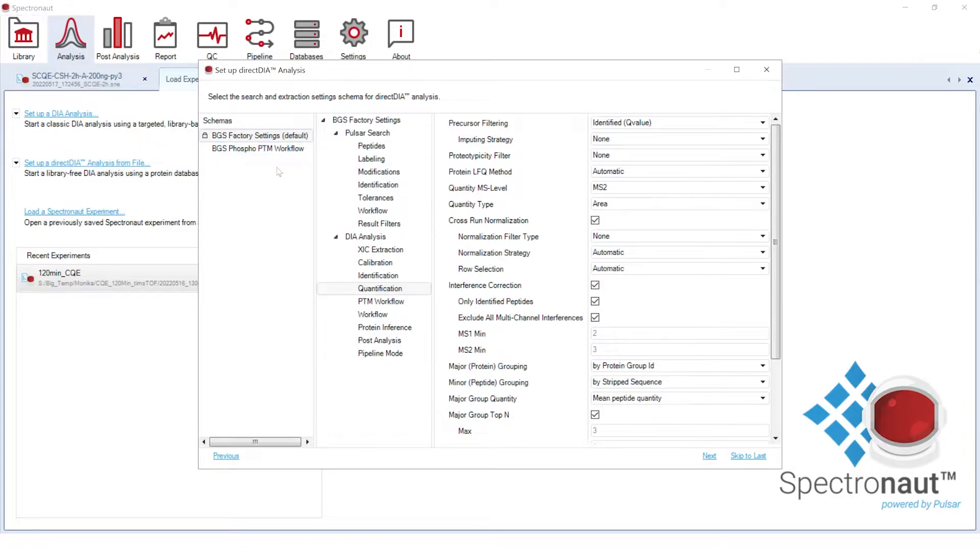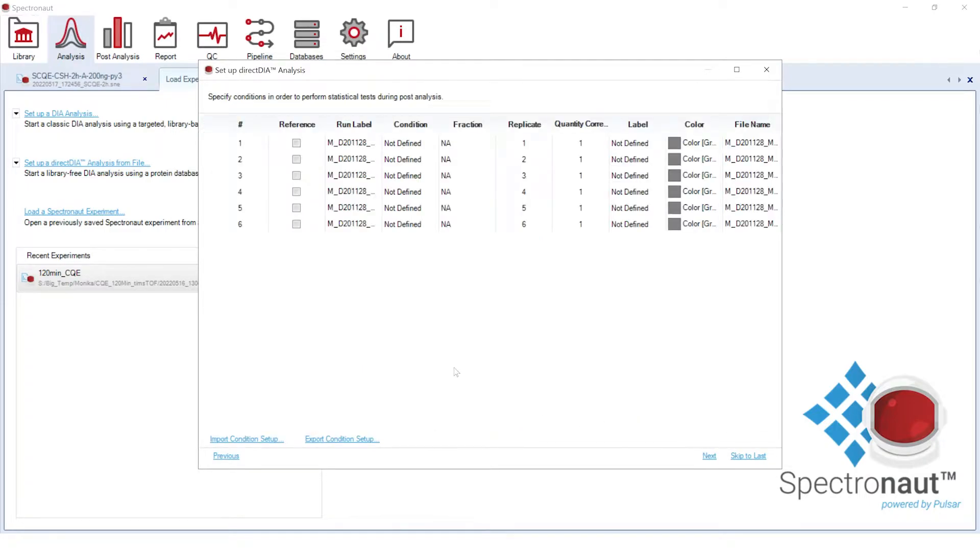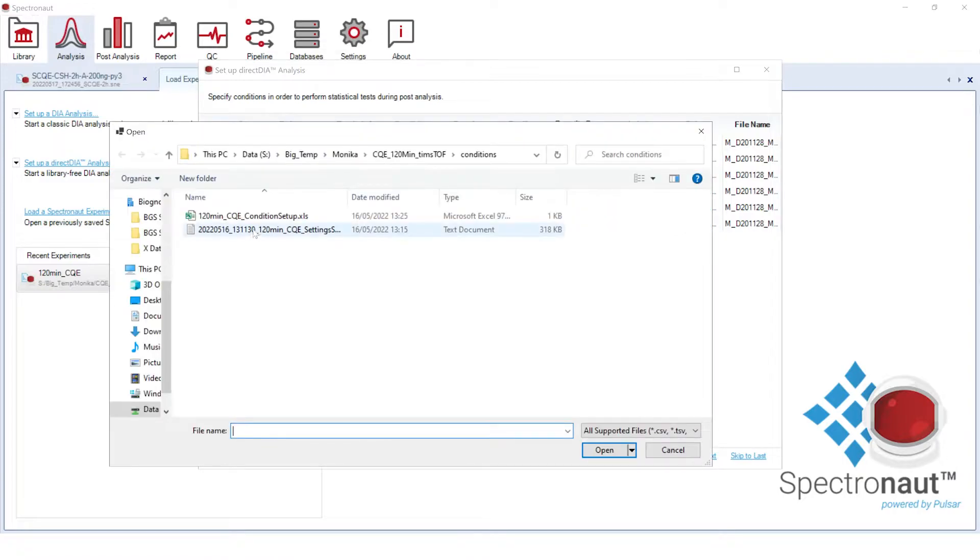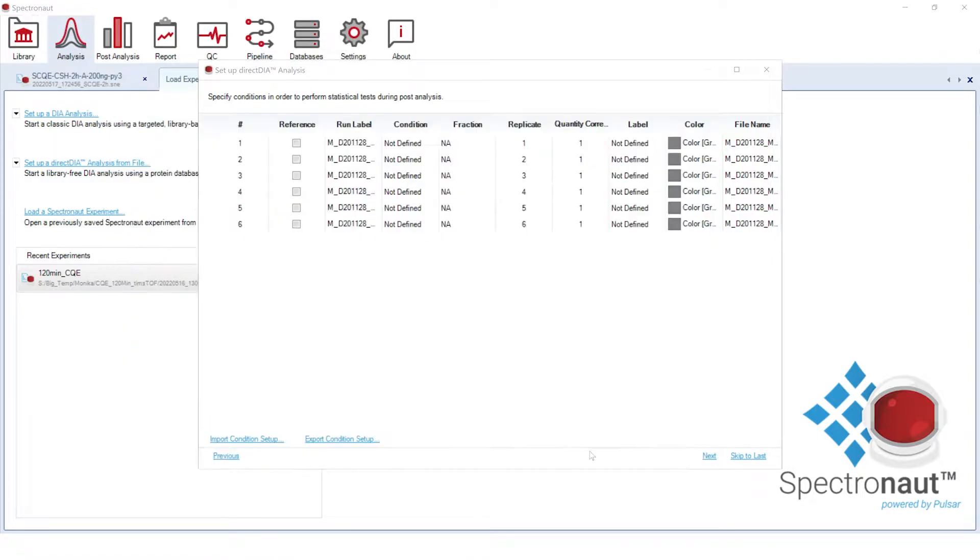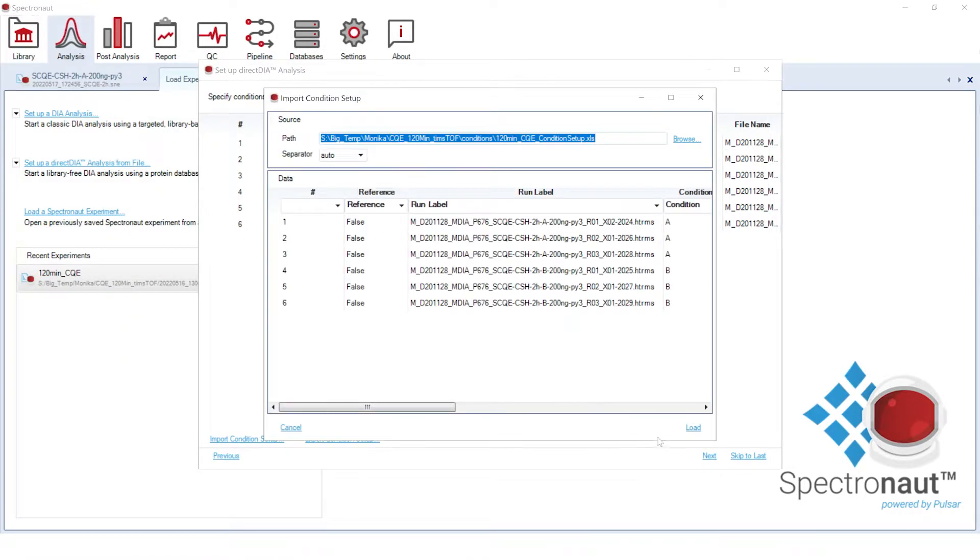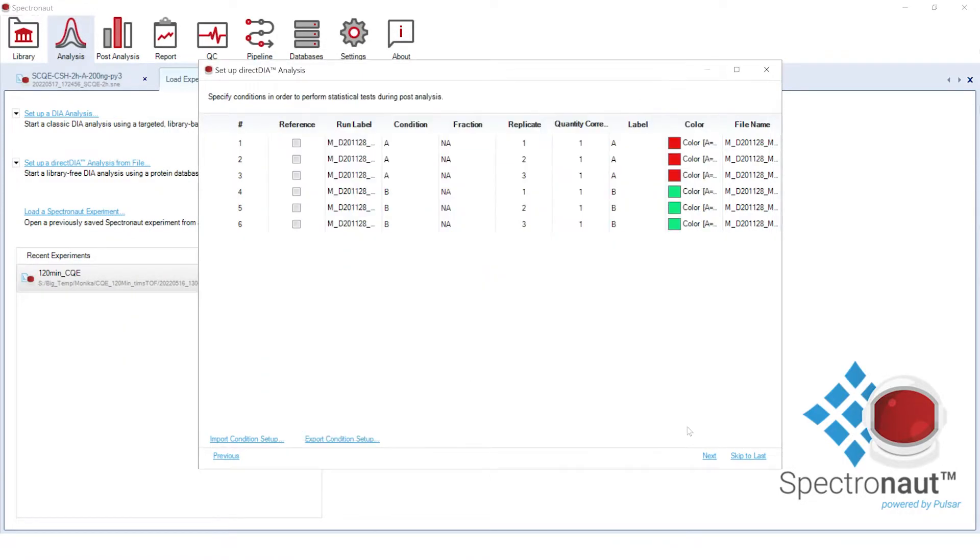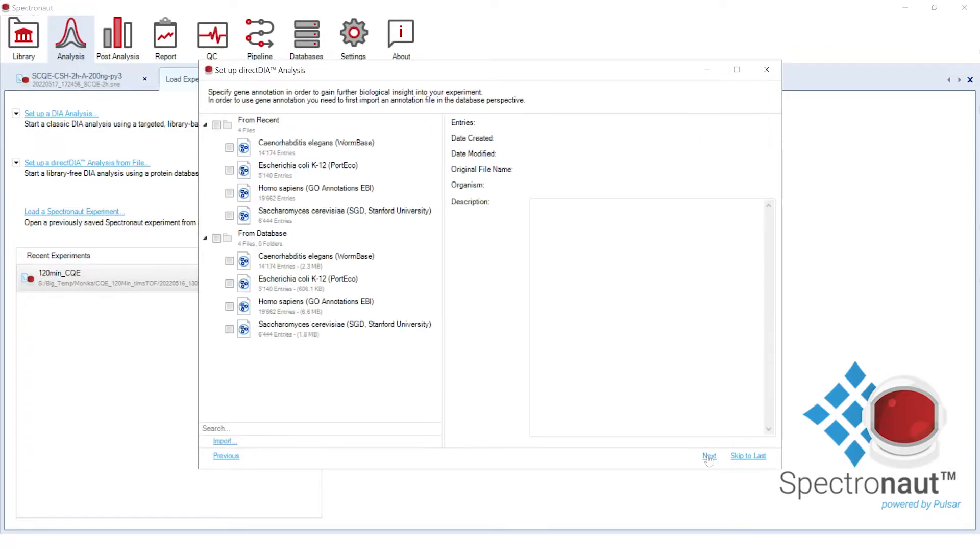In this step, we can specify experimental conditions by editing the condition setup or by uploading a condition setup file, predefined for the given project. Here, you can select the geo-annotation files for the geo-enrichment analysis.